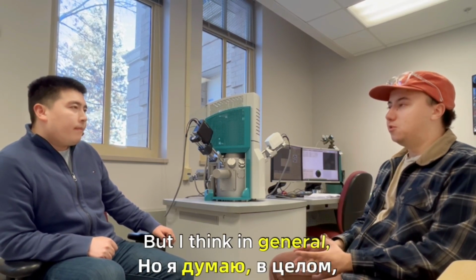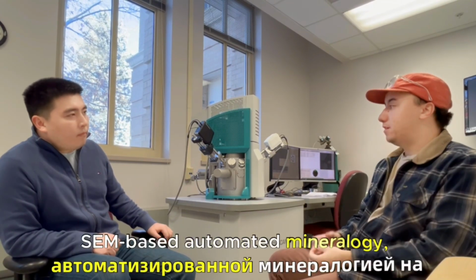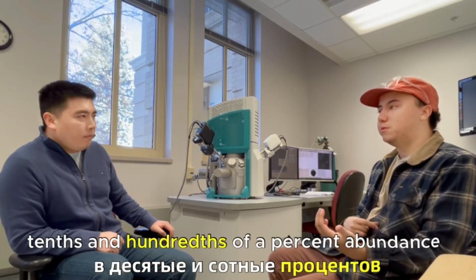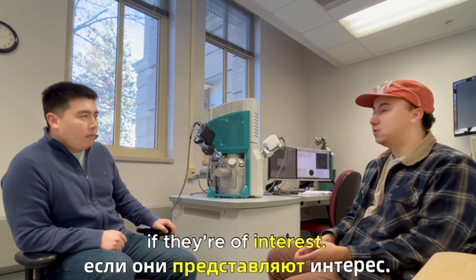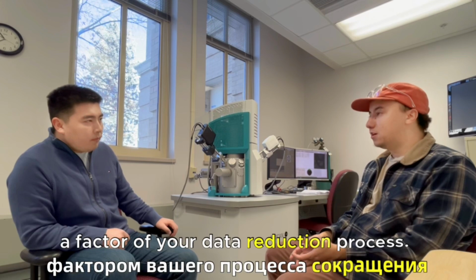But I think in general, XRD is only sensitive to several weight percent of mineral abundance. Whereas with SEM-based automated mineralogy, we can very easily go into tenths and hundredths of a percent abundance for different mineral phases if they're of interest. And a lot of that is a factor of your data reduction process.